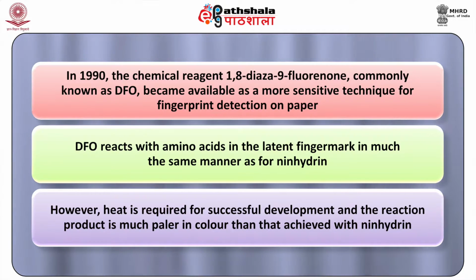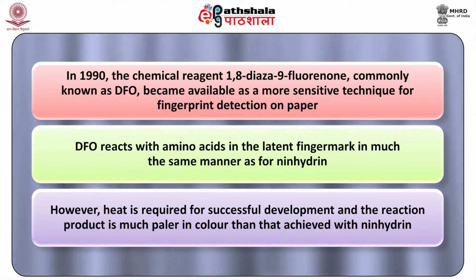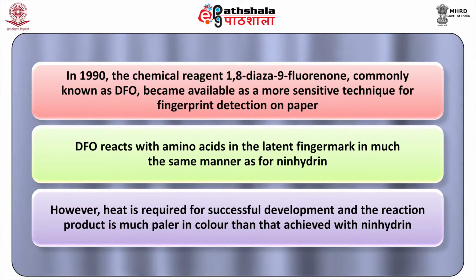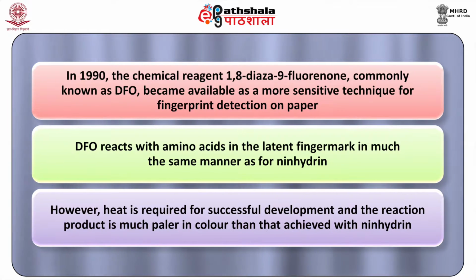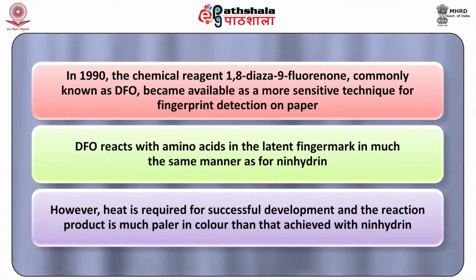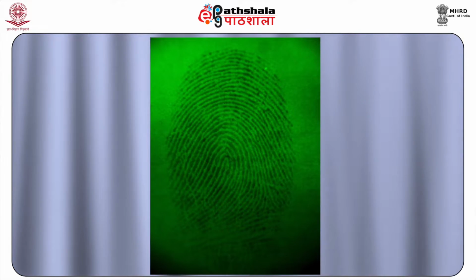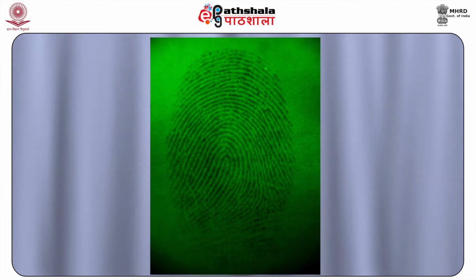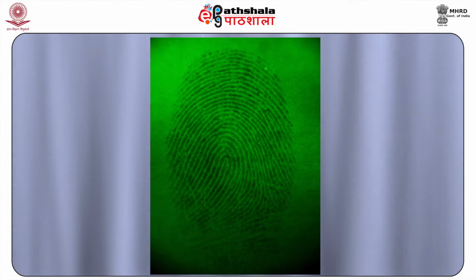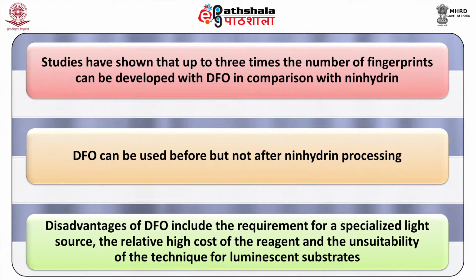DFO reacts with amino acids in the latent finger mark in much the same manner as ninhydrin. However, heat is required for successful development, and the reaction product is much paler in color than that achieved with ninhydrin. The advantage of DFO is that developed prints are highly luminescent at room temperature without any additional treatment. Studies have shown that up to three times the number of fingerprints can be developed with DFO in comparison with ninhydrin. DFO can be used before but not after ninhydrin processing.